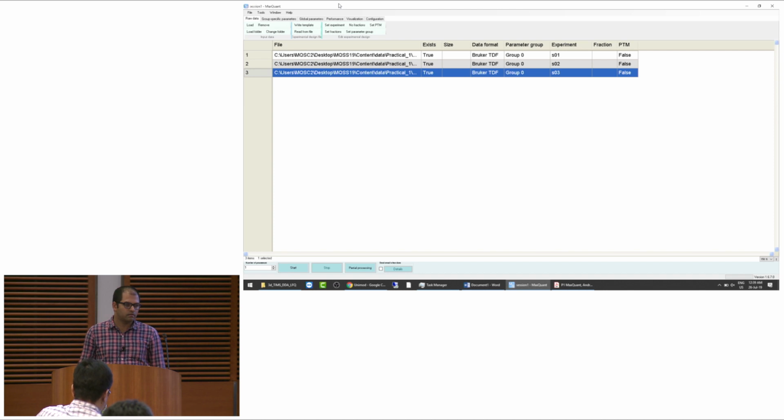I understand that when you do match between runs with multiple fractions, it looks at neighboring fractions when you designate them in the raw files page here. But what I was wondering about was, how do you do the retention time alignment if the matrix of each fraction is going to be slightly different because of its elution profile that may affect the retention time significantly?